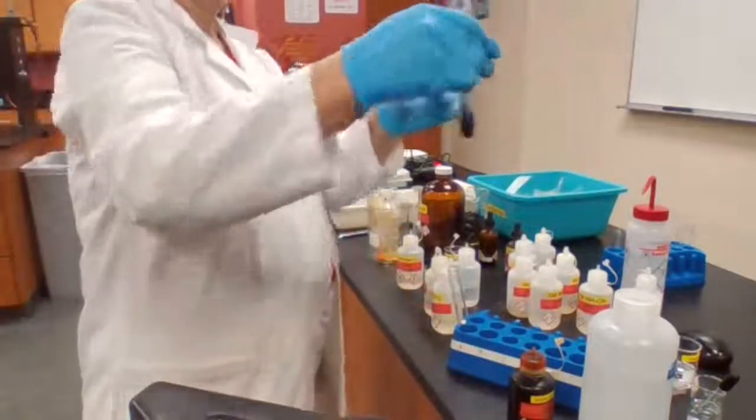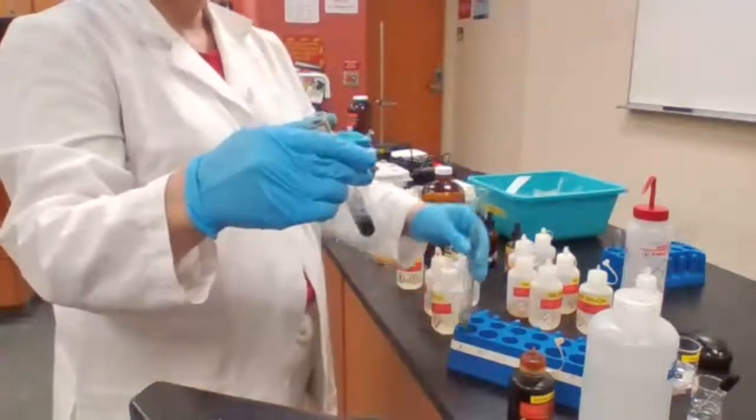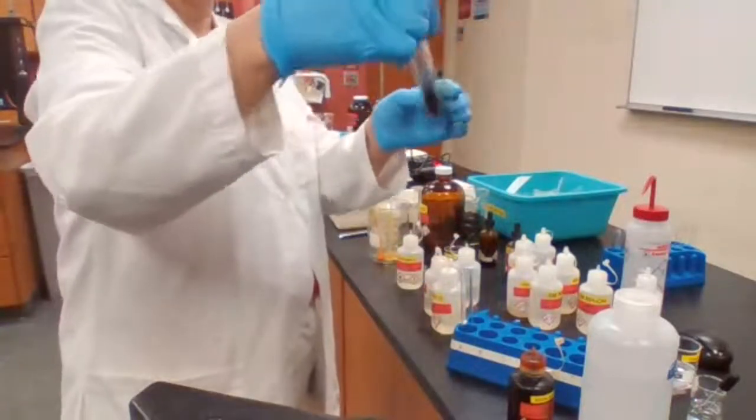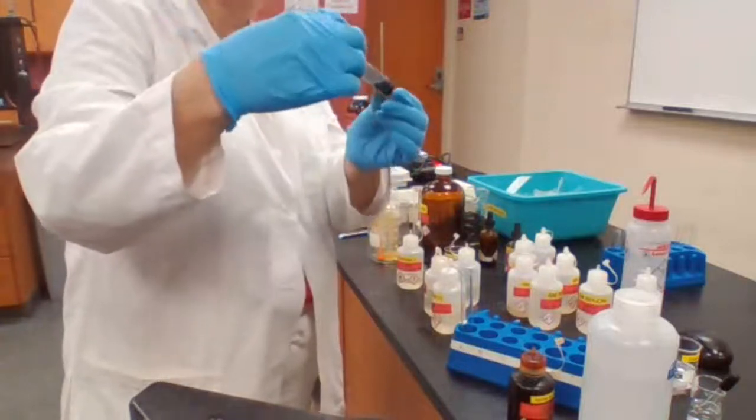And we have to wait. One of them is going to form a dark black precipitate, or is going to form a mirror.